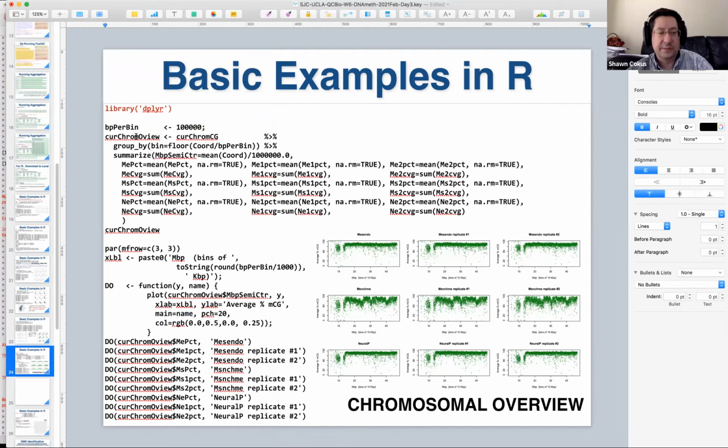So this is going to become the thing that we plot. You'll see what this is at the end, but it's basically going to have, for each condition, the summarized data in the bin, right? So we've got to rebin these things, and we've got individual chromosomal coordinates around. We've got to rebin it, but this thing is going to collect all the plotting data. So it's going to be organized by bin basically as the rows, and we've got the samples across, and the samples aren't going to have the point fraction, but some kind of average fractions in each column. And that's what we're heading towards.